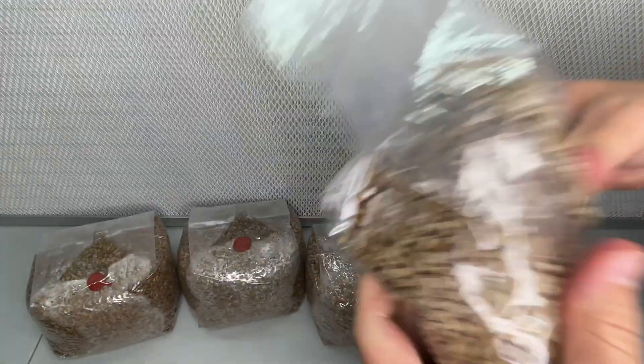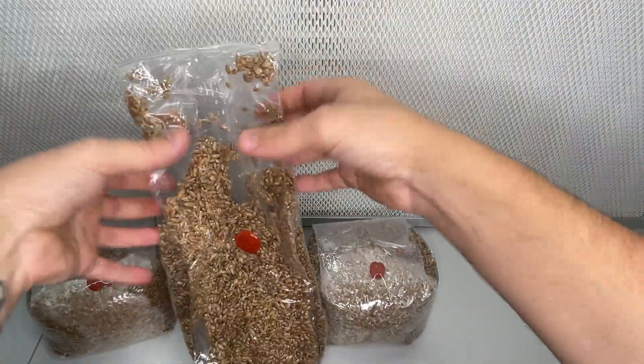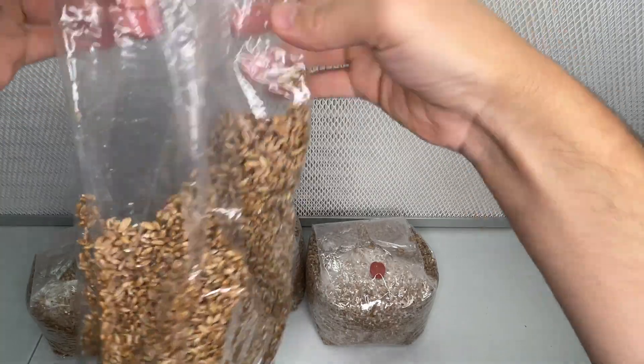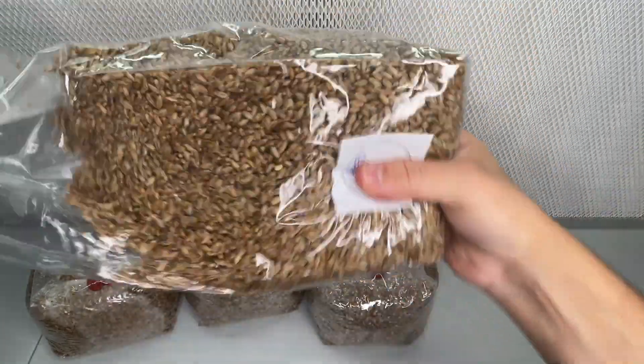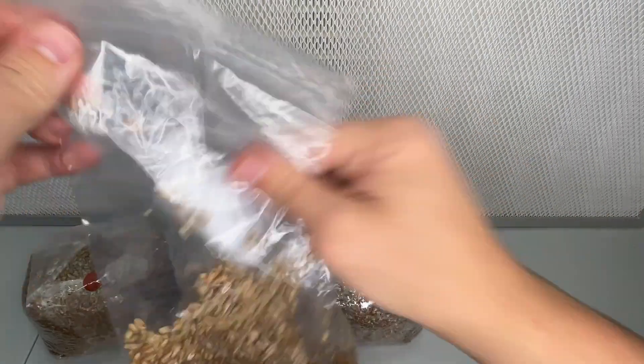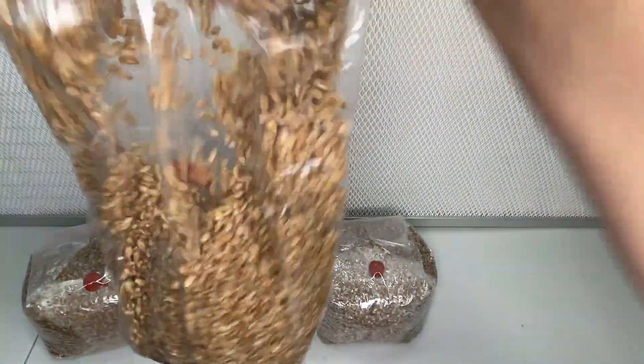Additionally, by expediting the colonization process, we reduce the risk of the grains drying out before full colonization. I massaged the filter patch bag and dumped the grains back and forth between the top and bottom to evenly distribute all of the mycelium grains.